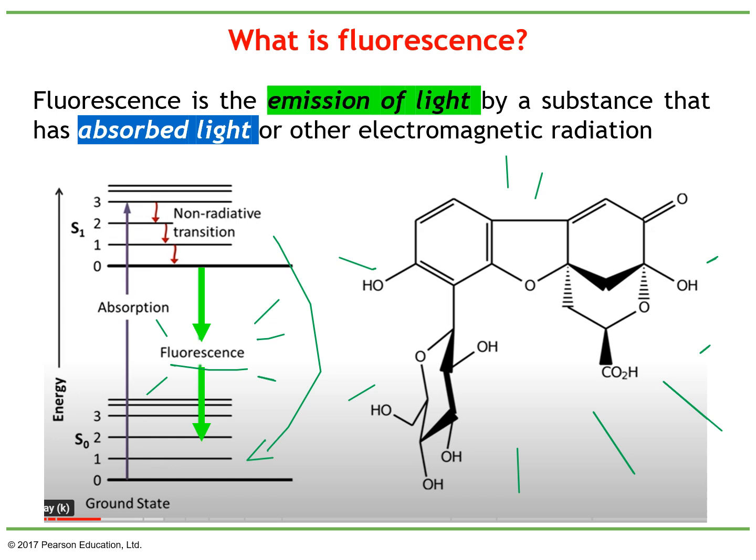And why that happens is because before that there was a different process, in which they were absorbing light. So this molecule, before emitting that light, has to absorb light that has high energy, so an increase in energy, and then to go back to the normal ground state, it will emit light and go back. So we go from a high energy state to a lower energy state.